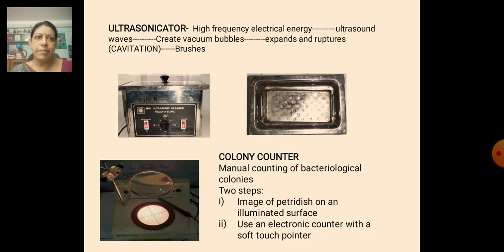Now in microbiology, the next is the colony counter. If we see a plate, we will see various cultures growing, and these cultures are in colonies. We cannot see a single bacterium with the naked eye.